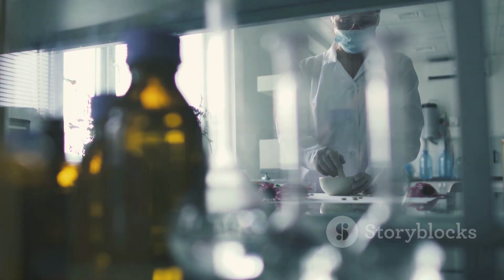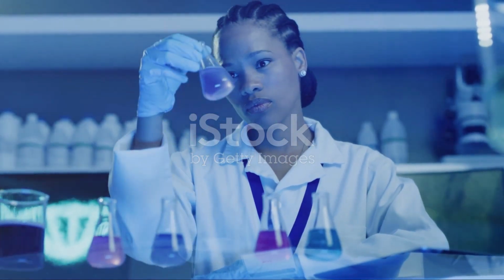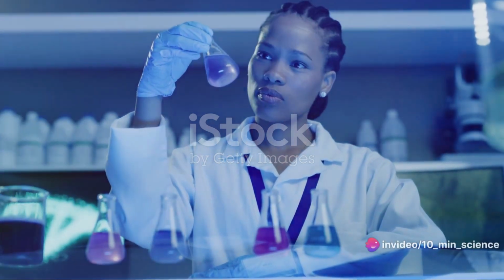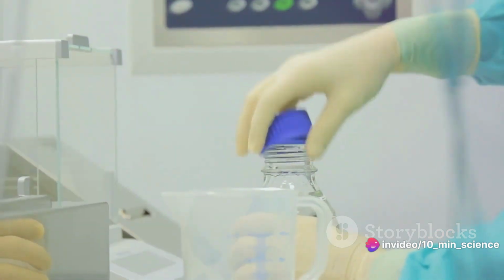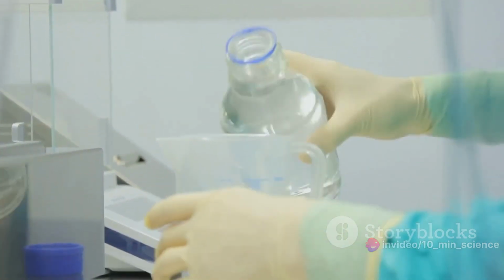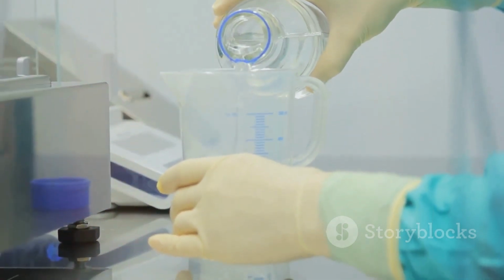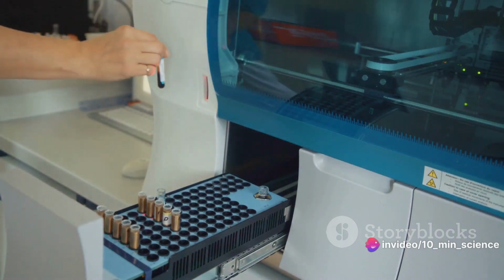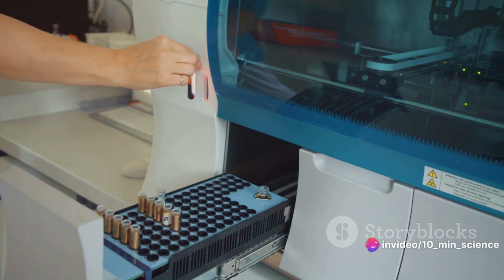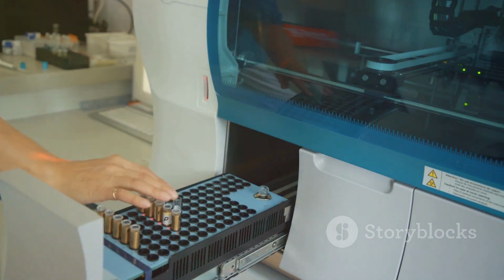Let's dive into it. First off, we need to select an appropriate internal standard. This choice is of paramount importance as it can directly affect the accuracy of the results. The internal standard should ideally be a substance that is chemically similar but not identical to the analyte of interest. It should also be unaffected by the sample preparation steps. In addition, it should not interfere with the analyte signal, and its response factor should be consistent.